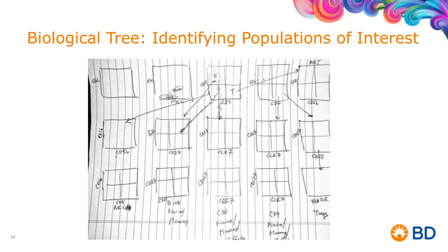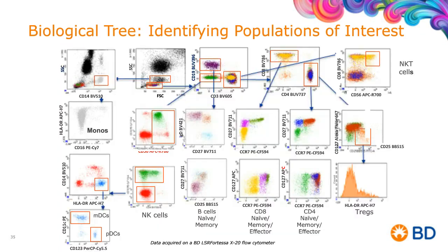But we do like to do this because our goal at the end is to take something exactly as written this way and transform that into this, where we have defined populations. The orthogonal expressions and the specificities that we see look really good.